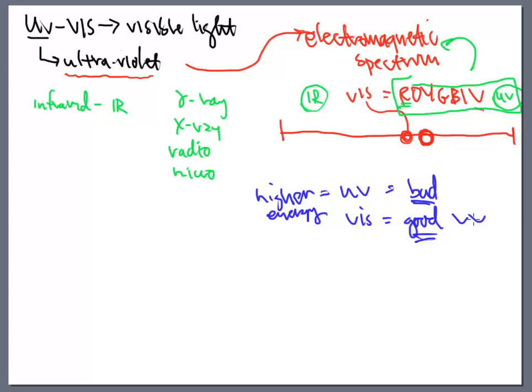All right, now before we go, I just want to bring up a word called a spectrometer. A meter is anything, of course, that measures, right? So we have a lot of meters in the laboratory. This is one of those meters. It measures something.